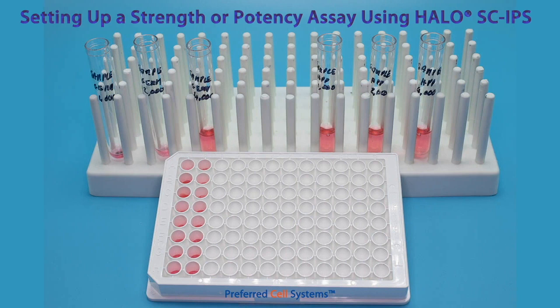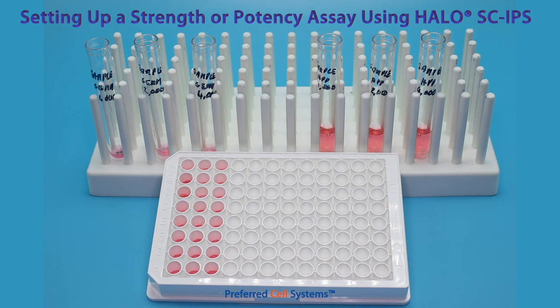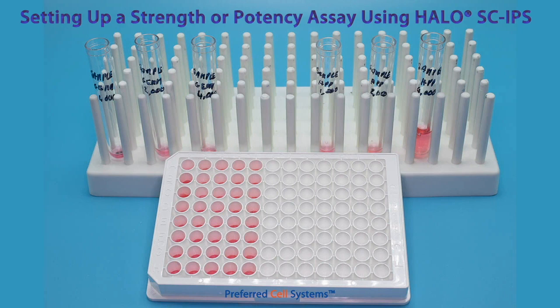Now fill each of the wells in the second column with 0.1 milliliters from the second sample SC-IPS Halo Culture Master Mix. This will reduce the second cell concentration from 20,000 cells to 2,000 cells per well. Fill the third column wells with 0.1 milliliters from the highest SC-IPS Halo Culture Master Mix, thereby reducing the cell concentration from 40,000 cells to 4,000 cells per well. Repeat this procedure for the sample SC-HPP Halo Culture Master Mix. They will occupy the 4th, 5th, and 6th columns of the plate. At this point, half of the plate will now be occupied with cell cultures.